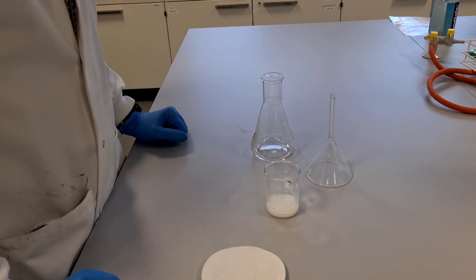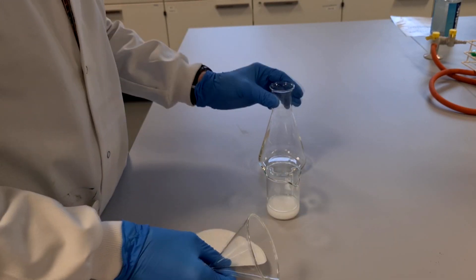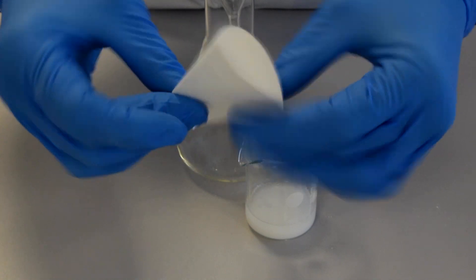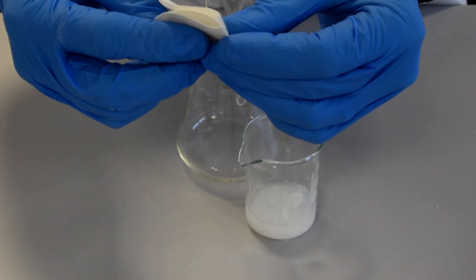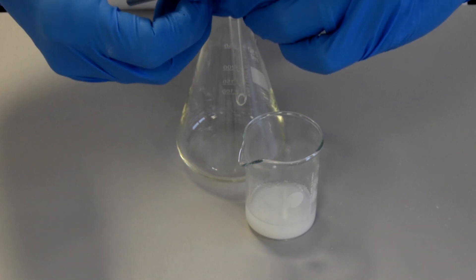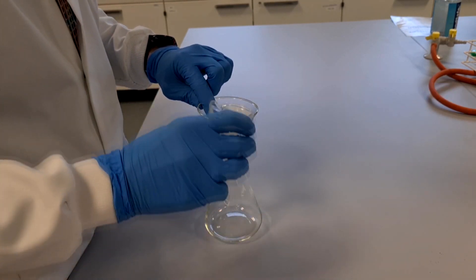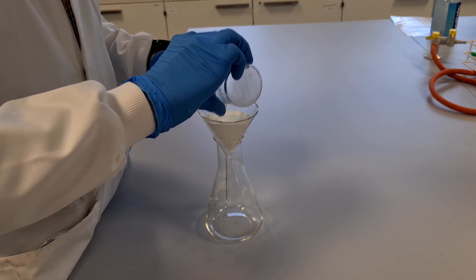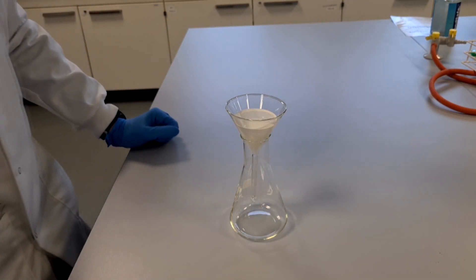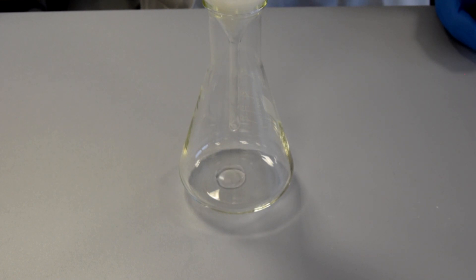To carry out the filtration stage we need a conical flask, a filter funnel and some filter paper. We set the filter funnel in the conical flask, and then to fold the filter paper we simply fold it in half, fold it in half again, and then make that into a little cone to filter the excess magnesium carbonate from the magnesium sulfate solution. If I pour this in now, what we should see is a colourless solution.